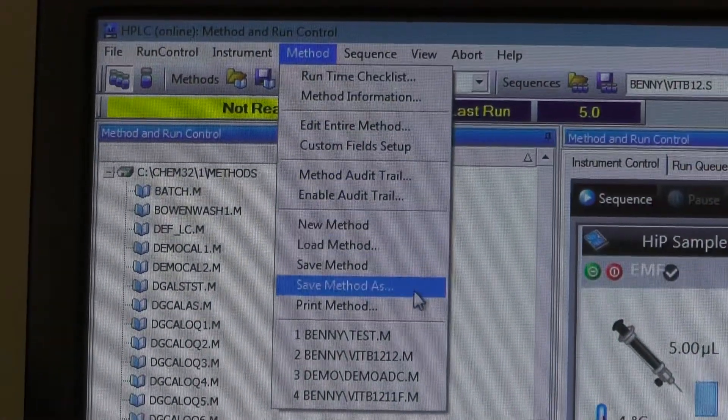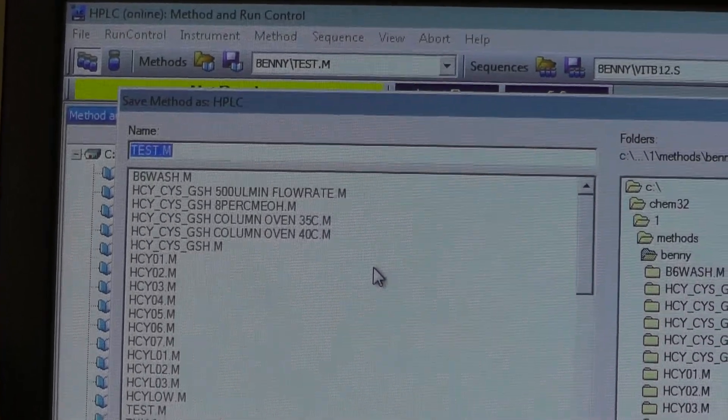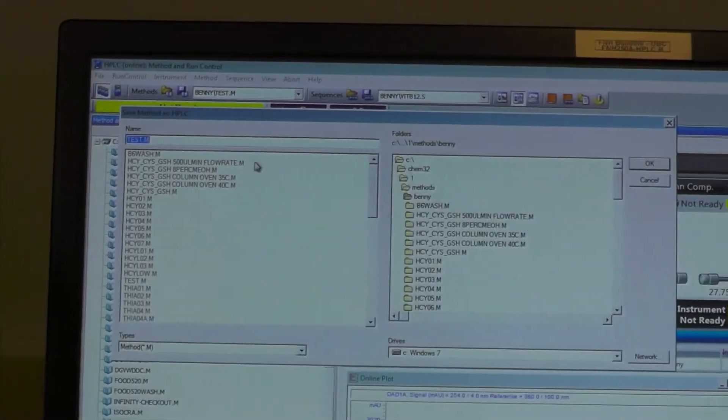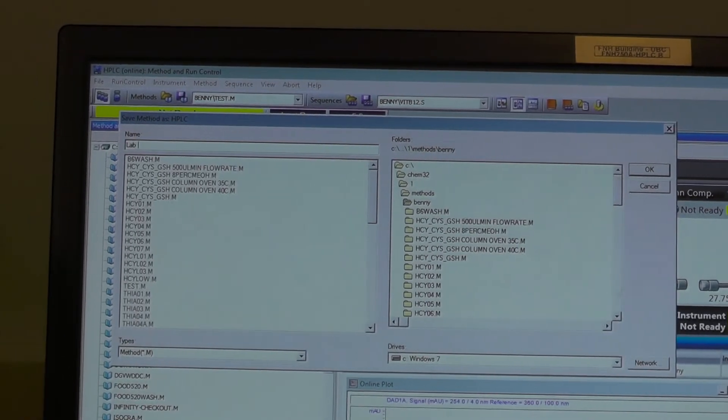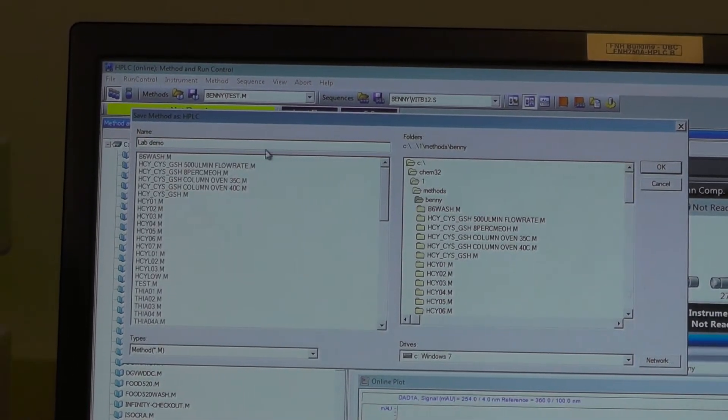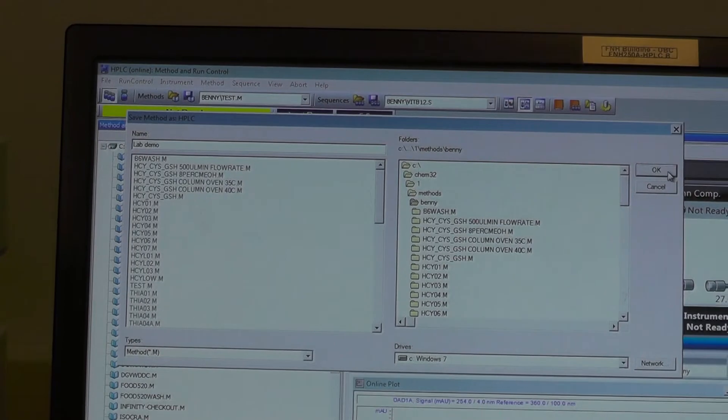After adjusting the method, select Save Method As and save your method in the Method folder. Please note, always select Save Method As instead of Save Method so that you do not override the original method.